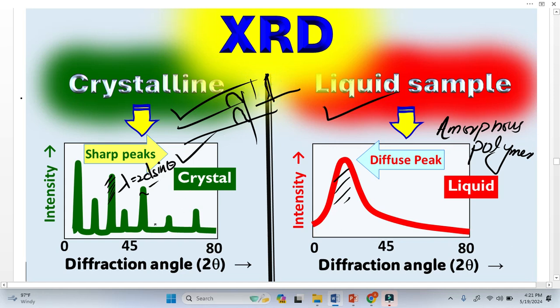Now, in these areas where the intensity is zero, there are no peaks. This means that Bragg's law is not satisfied here. So this confirms that crystalline material gives sharp peaks in the XRD pattern.